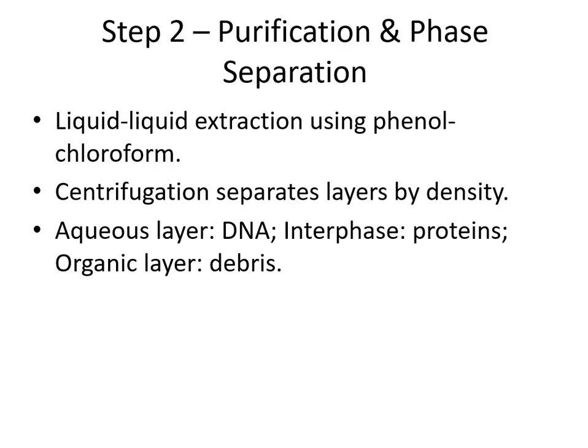For the purification of DNA and to separate its phases, the initial stage includes extraction of the pure form of DNA using the phenol chloroform method.